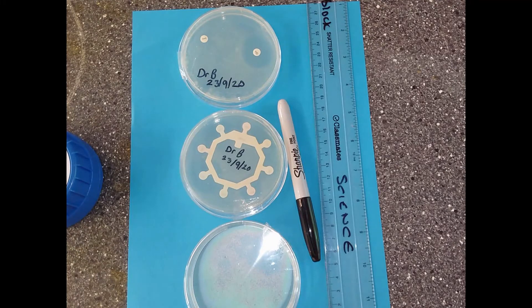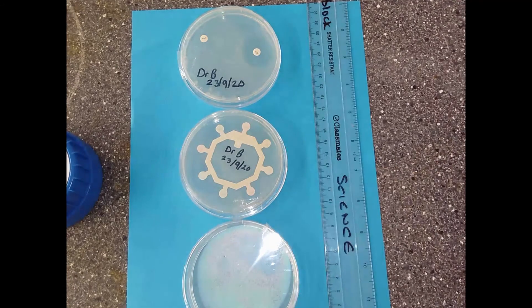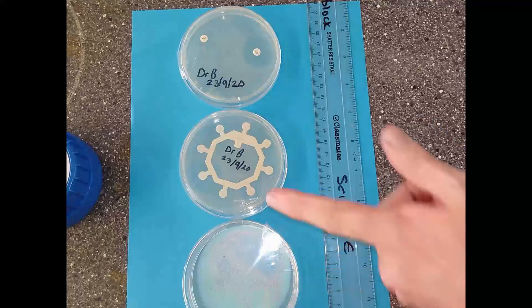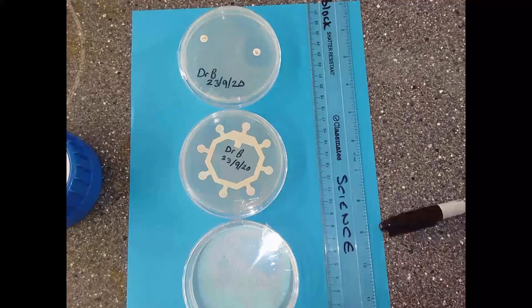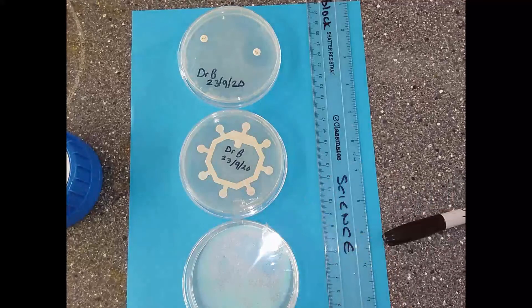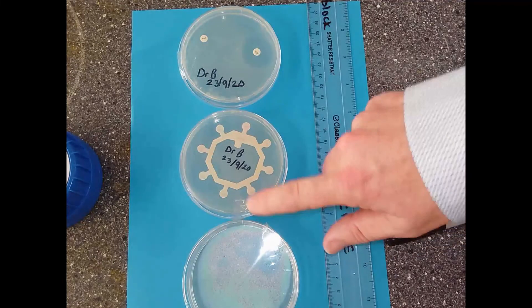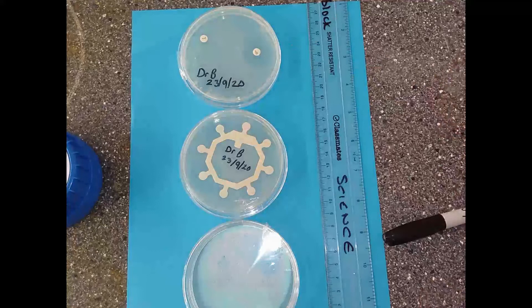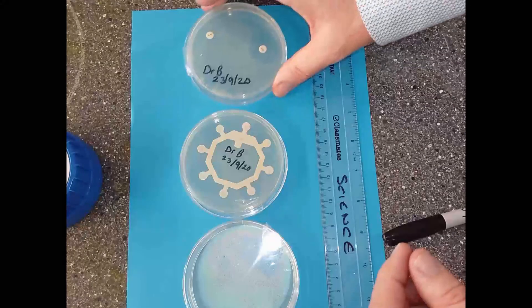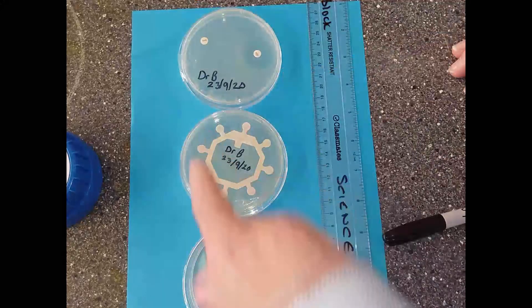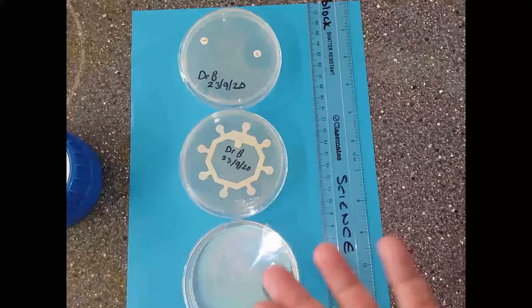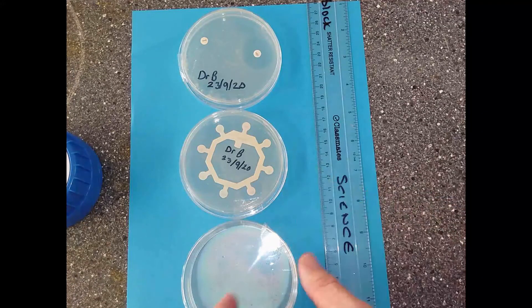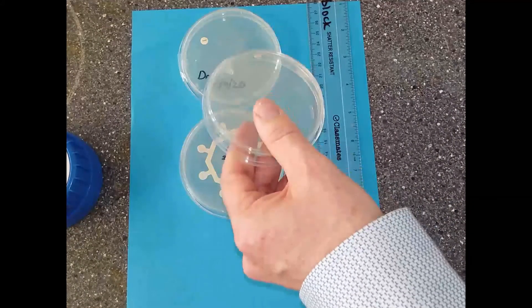This is day two, after 24 hours, and we've got our three agar plates. The first thing I'm going to say is that yesterday I forgot to tell you we needed to put two bits of sellotape on each of the lids just to keep the lids in place. I didn't seal the petri dishes because if I seal them, I'm going to stop oxygen getting in and I can actually grow some really dangerous microbes.